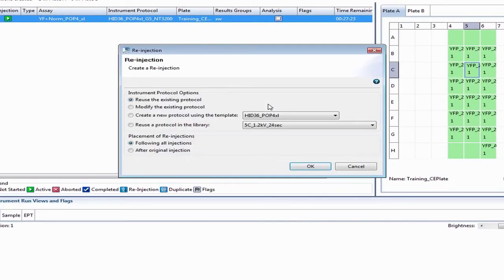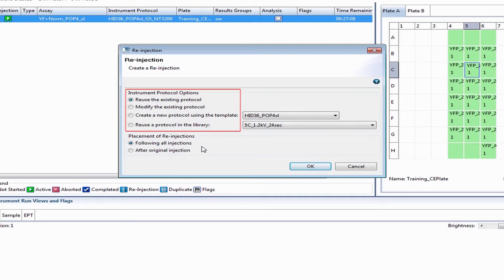A pop-up box will appear. This is where you can choose to reuse your existing protocol for that sample, modify the existing protocol, create a new protocol from a template, or reuse a protocol that exists in your library. You also specify whether you want the reinjections to occur immediately after the original sample injection or after all the injections that are still pending.